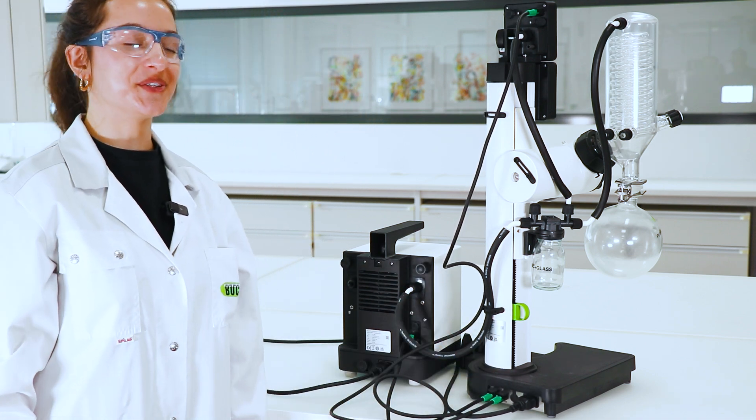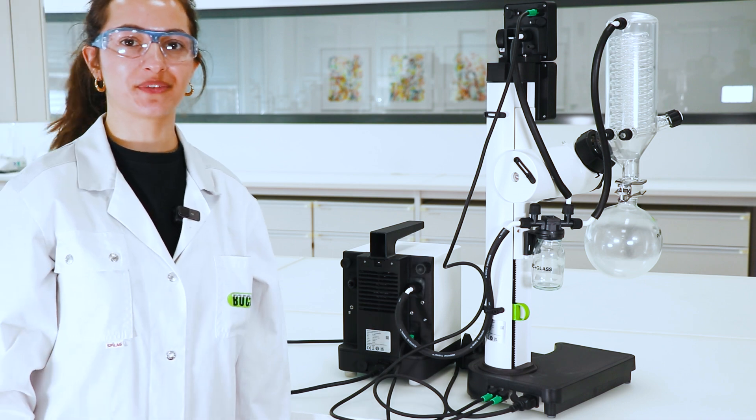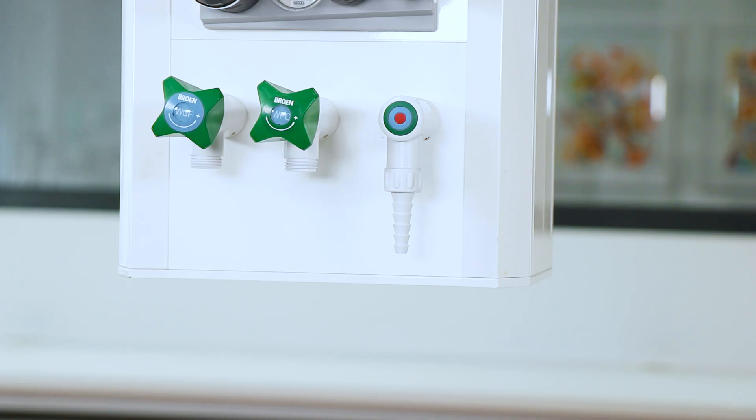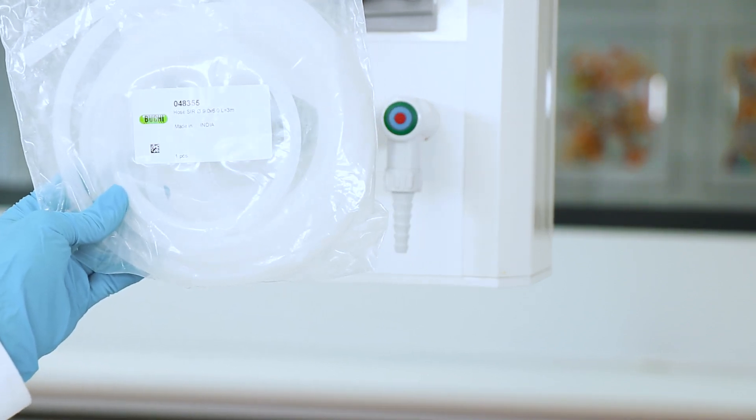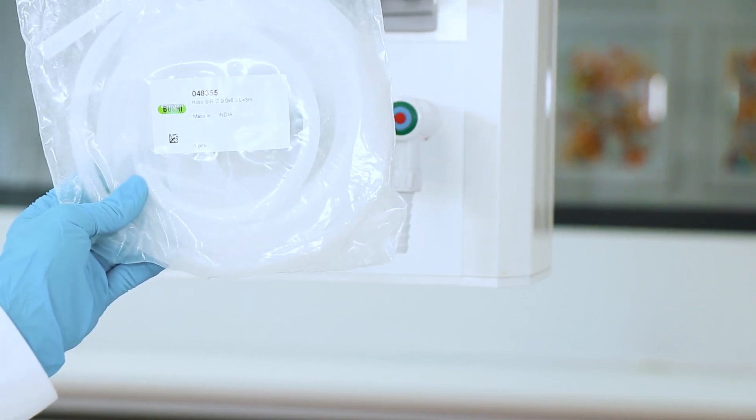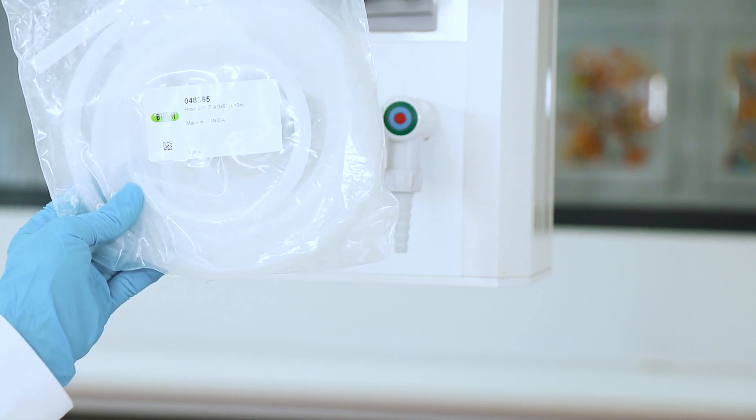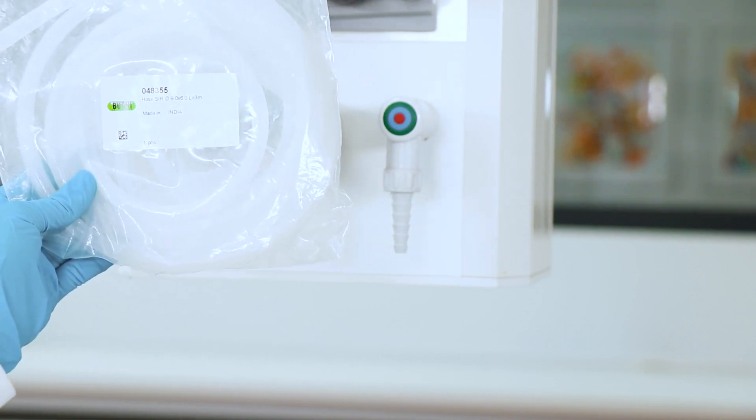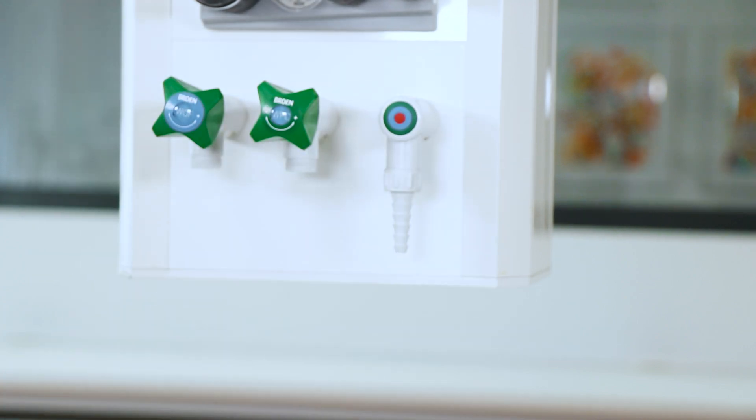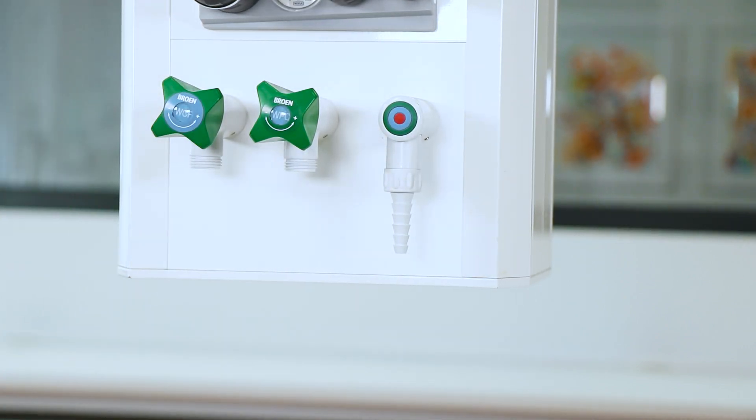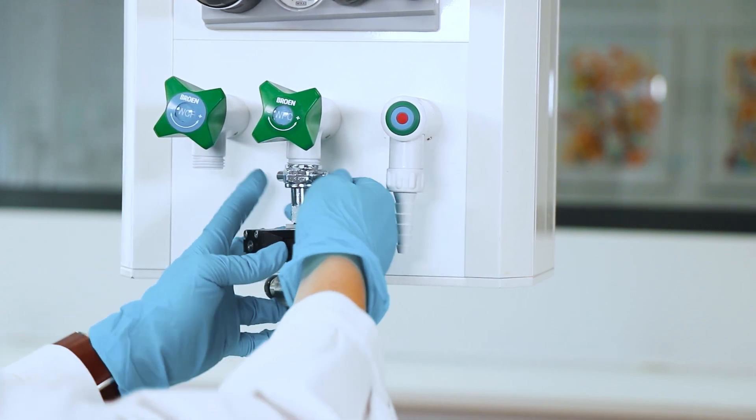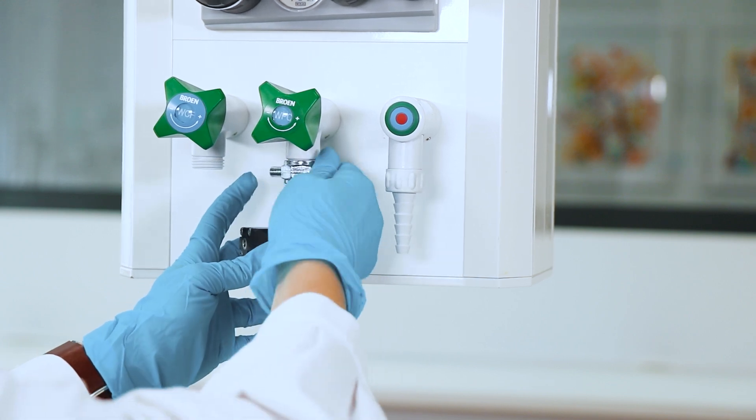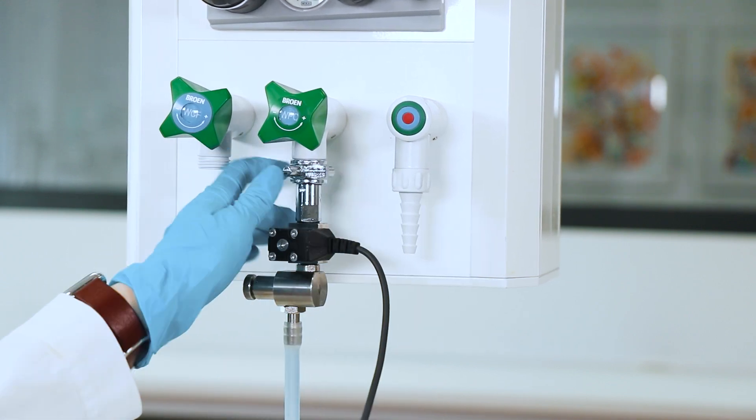Now the last thing we need to do is to connect the water, the cooling water. So then you take the cooling tube and you as well have to cut it into three pieces. We recommend two pieces about one and a half meters and one five centimeter piece. If you have a cooling water valve, you can connect it here. You connect it to your cooling water outlet.